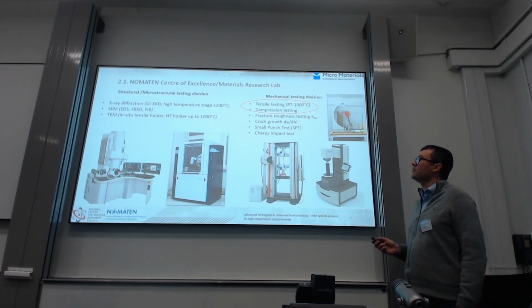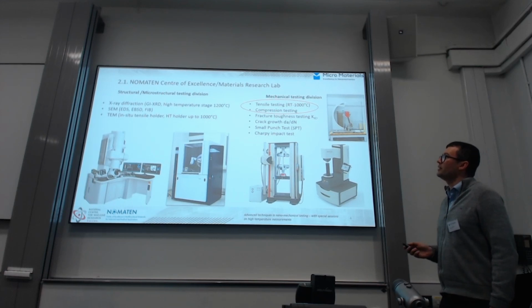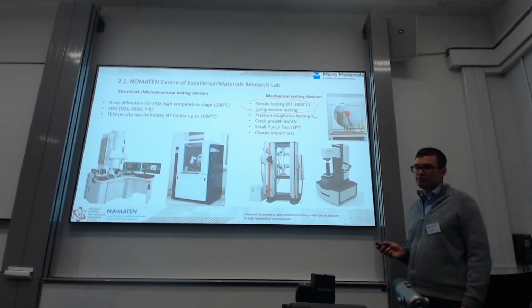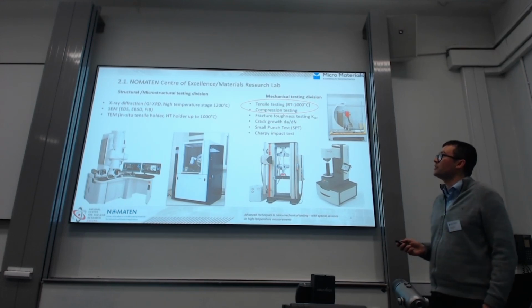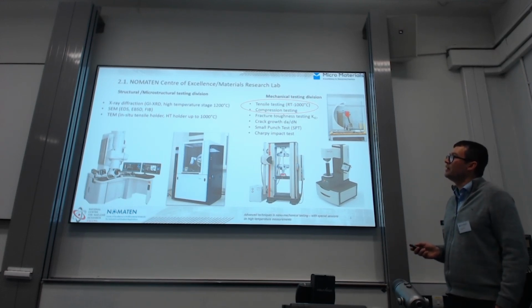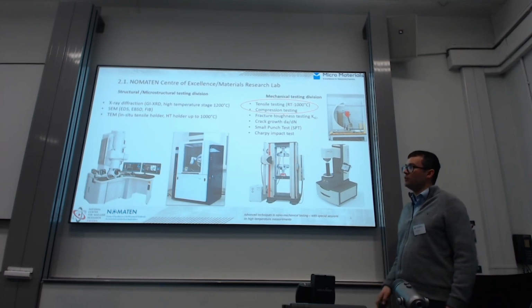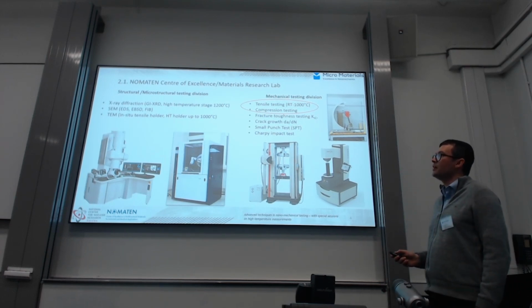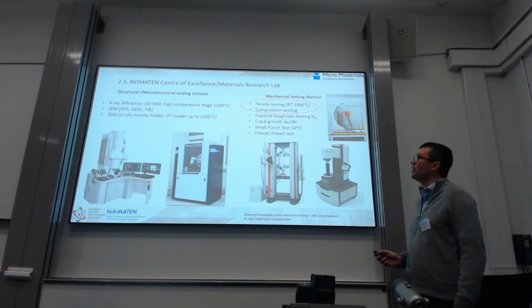We have in our lab several different departments, maybe small divisions. We are focused, as I said, on nuclear materials, but mainly for high temperature applications. So most of our equipment is equipped for high temperature in situ study. For example, the X-ray diffractometer has an in situ holder that can heat up to 1200 degrees C. The same with the transmission electron microscope. We have a holder for high temperature studies.